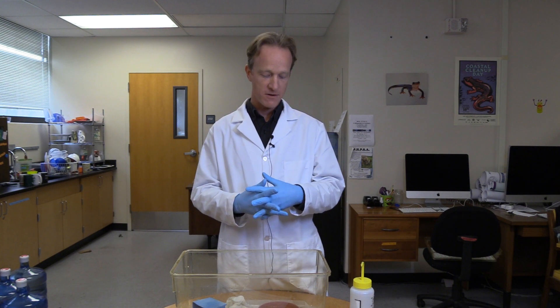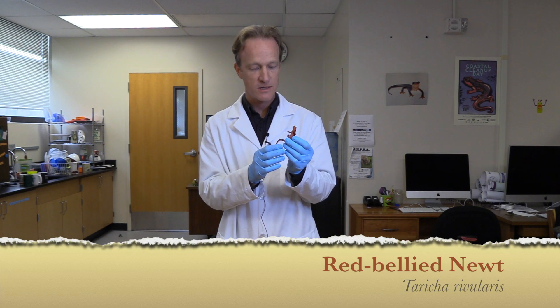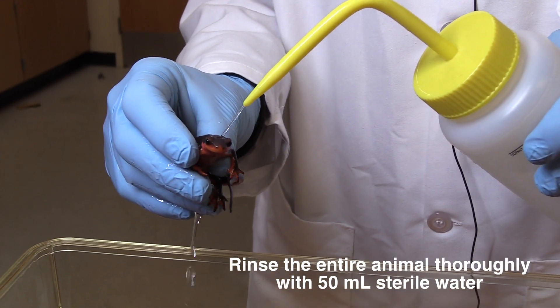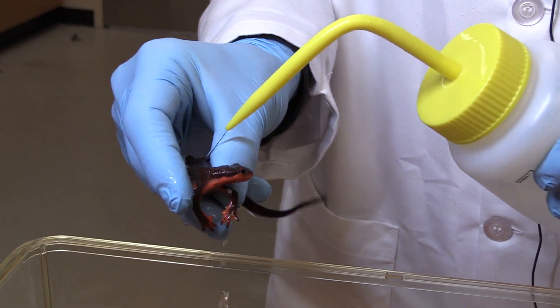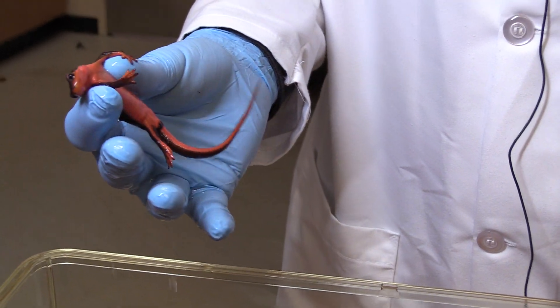I'm going to collect the skin microbiome swab from a newt. We've got Taricha rivularis, which is a red-bellied newt found here in California. I'm going to start by rinsing him off with 50 mls of sterile water. The idea here is to knock off any transient bacteria. And we're ready to collect the swab.